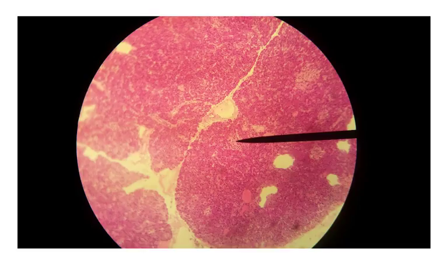This is something that we talked about a little bit previously in digestive. When the pancreas is adding its digestive enzymes into the digestive tract, it travels through this pancreatic duct. Well, those enzymes have to be made in the pancreas. And the majority of what we're looking at here, these dark, dark pink, almost purple cells that are almost the entire structure here, are called aceni cells. And aceni cells make the digestive enzymes that the pancreas secretes. But scattered throughout the aceni cells are lighter pink areas. And these are the islets of Langerhans. These are the endocrine portion of the pancreas.